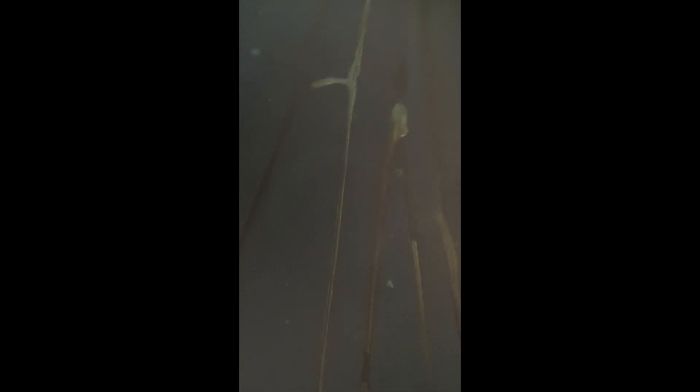This is just my hairy legs — I'm just kidding, I wanted to freak out some people that were watching. Nope, this is indeed just another wing of a fly, but this is on bright field. So you can kind of see a little bit different texture with the light.